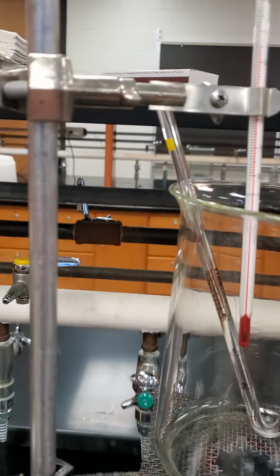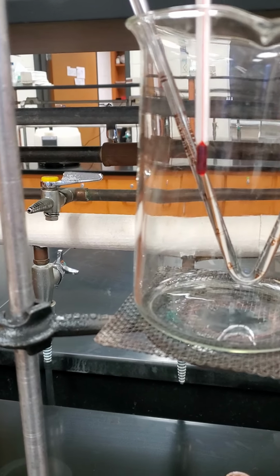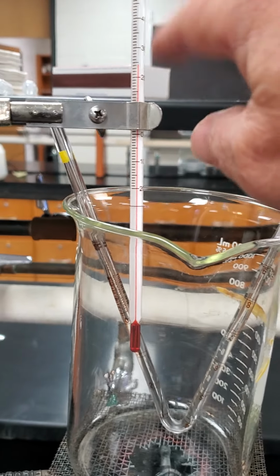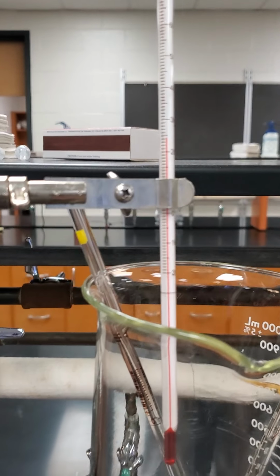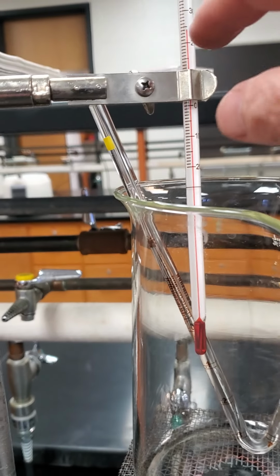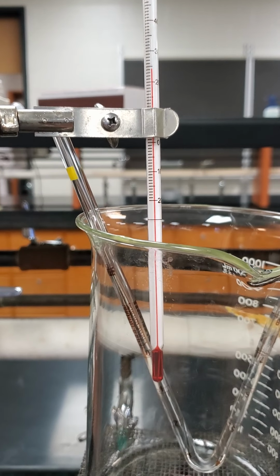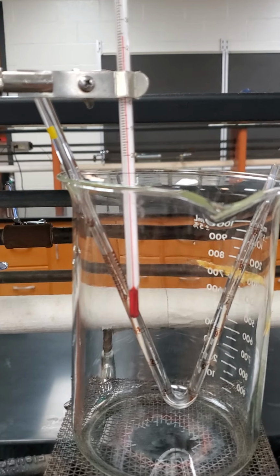Now I'm going to add water, so the water will come up to about here. Then I'm going to start to heat the water. As you heat the water, the temperature will change. I'm going to take temperatures every 10 minutes, and with every temperature measurement, I'm also going to measure where that bubble is. I'll show you how to do that. Right now I'm going to put some water in it, and then we're going to start the flame and then start the experiment.